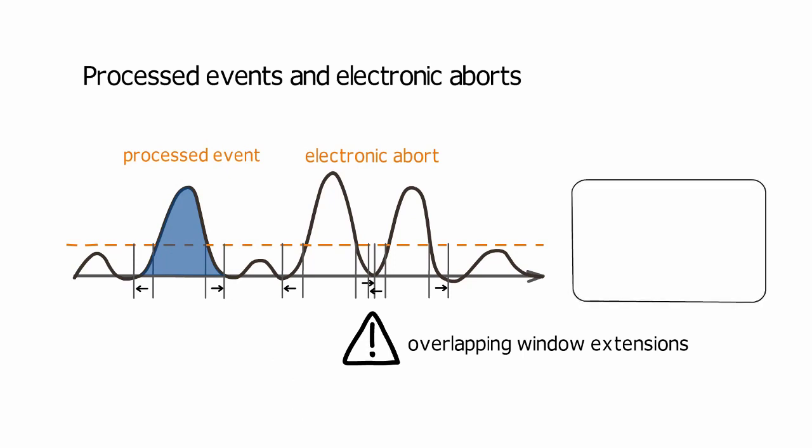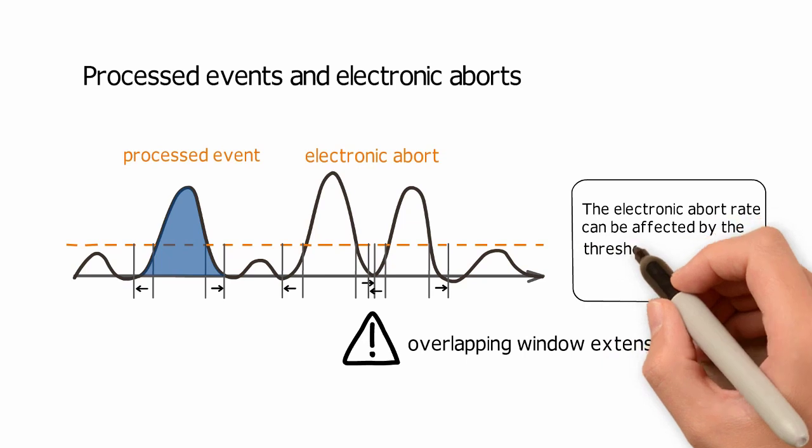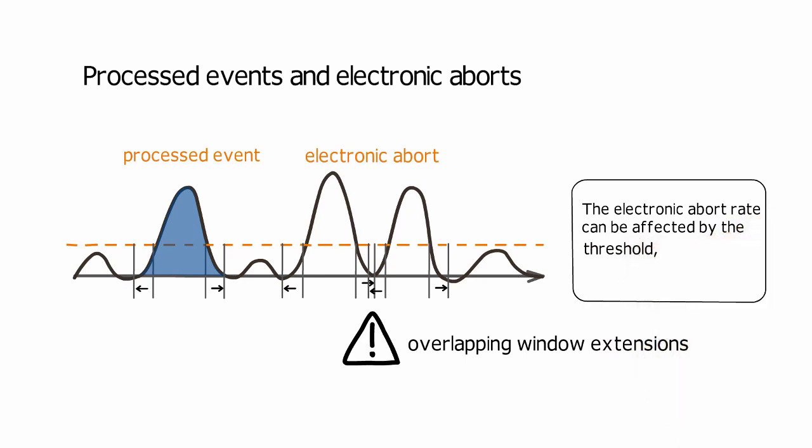One reason you might see a high electronic abort rate is a low threshold setting, which might allow the system to count debris as events. A high electronic abort rate could also be due to a high event rate, which can be controlled either by adjusting the flow rate on the instrument or the cell concentration of the sample.